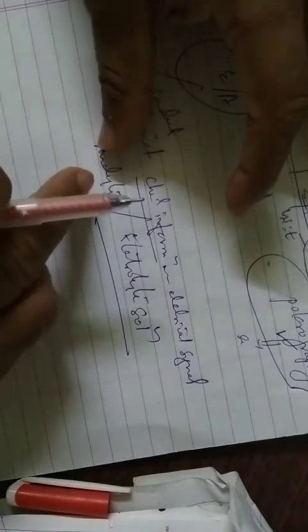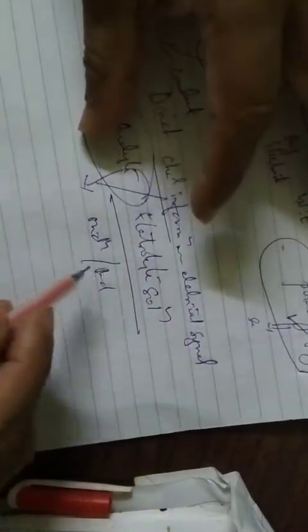And to detect the oxidation reaction it undergoes. Whenever the analyte is varied with the potential, whatever changes take place, like oxidation or reduction, can be detected here. And when the oxidation occurs, it is called anodic current.